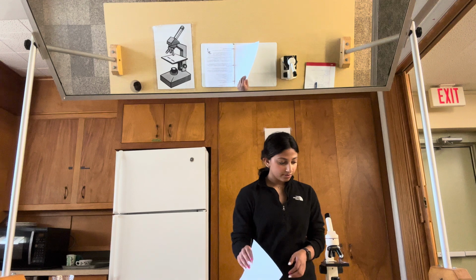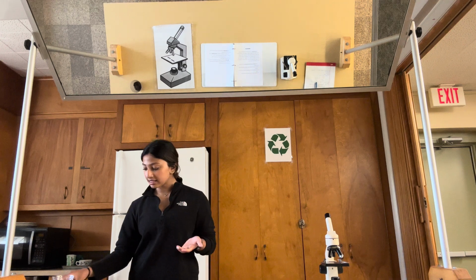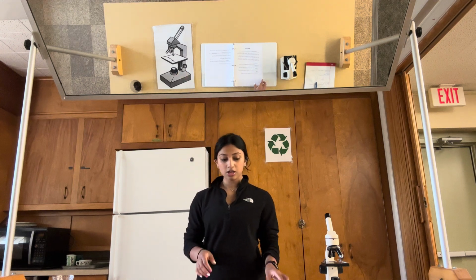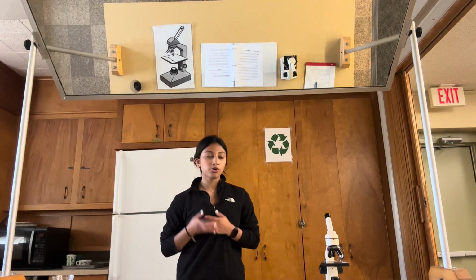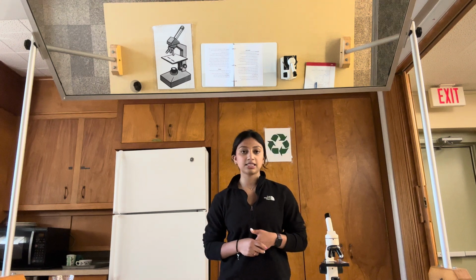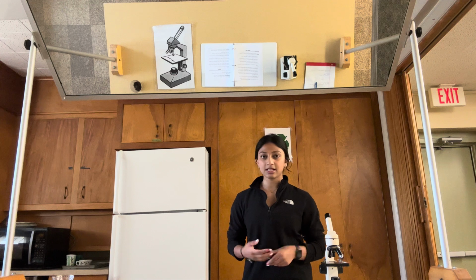Okay, so in this demonstration, we're going to show you how to create a slide, although most of the slides at the site will be already prepared for you. So there will be 3 stations. Station 1 will include slides about food, like strawberries and yogurt. Station 2 will include slides about the environment, like dirt, pond water, and leaves. And Station 3 will include slides about me.